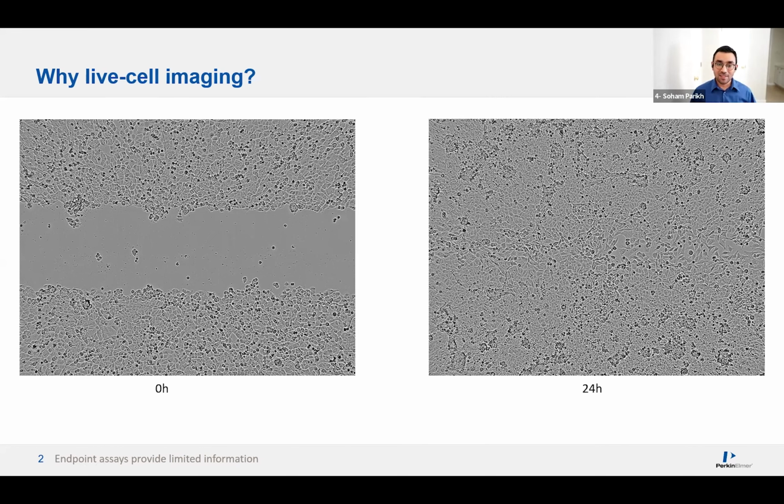When I was a researcher, I always used to take all the immunofluorescence images, or just images, at static time points, such as you see here. I would take images at 0 hours, 24 hours, 72 hours, 36 hours, right? And I felt pretty happy with my workflow back then. But what I was forgetting, or what I could have actually done, is look at the blind spot in between those different time points. For example, if you are incorporating some drug and you are seeing the drug effect at static time points such as 24 hours, 48 hours, you're actually missing out on a lot of details in between the 0 time point and the 24-hour time point.